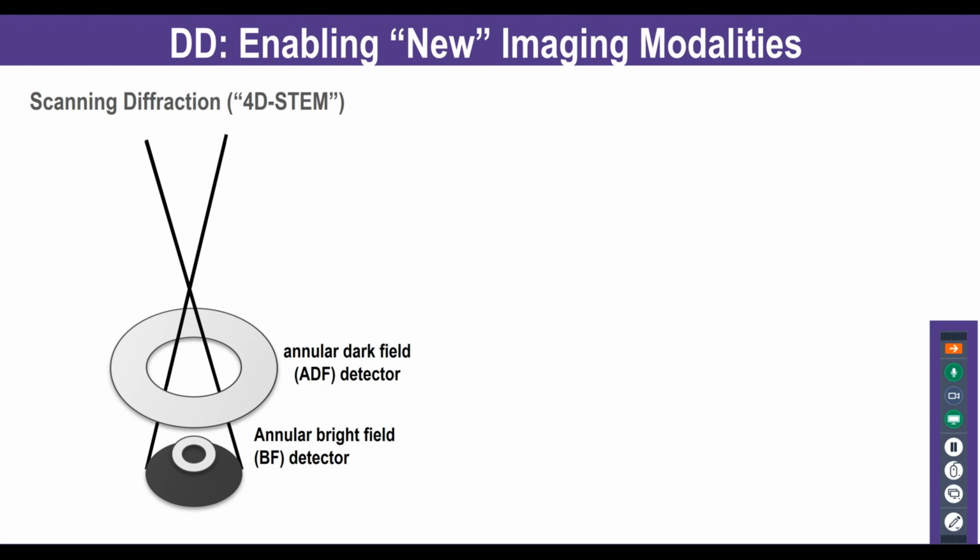And at the same time, the improvement of the microscope itself, with the aberration correctors and so on, brought us fantastic work using high resolution STEM, where you can see down to 0.5 angstroms pretty much.